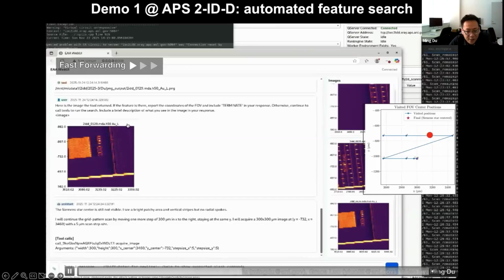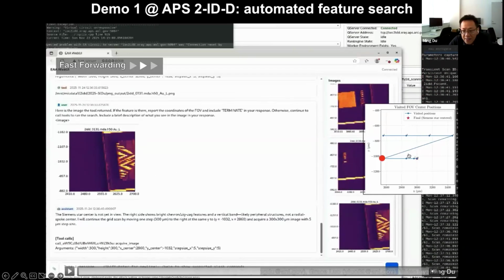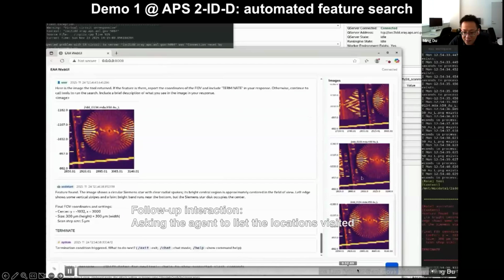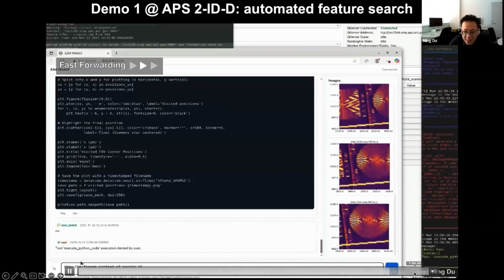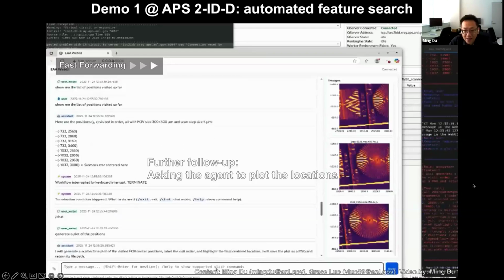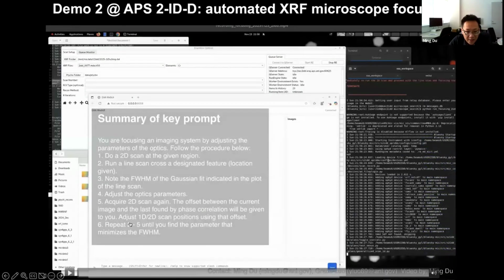So it just makes further tool calls, and this plot that we are showing here visualizes the position of the scan in the sample. You can see it moves constantly and approaches the sample. For the sake of time, I'll just fast forward this. But eventually, you can see. I hope this shows the idea. There's another example which I'll also probably just fast forward.